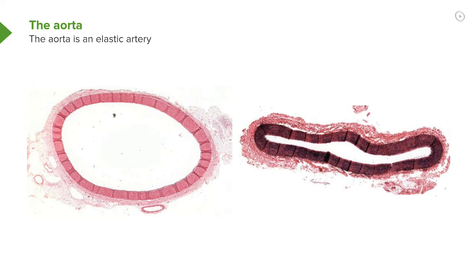The tunica media has been stained for elastic tissue. You can see that the dominant fibre in the tunica media of the aorta is elastic tissue. It has a very, very important function.